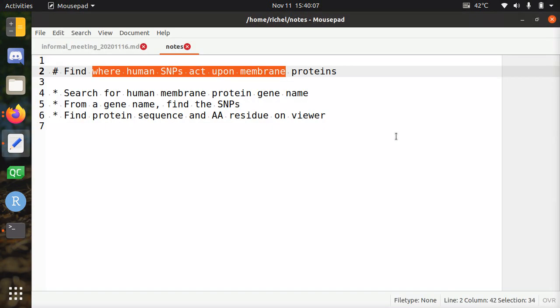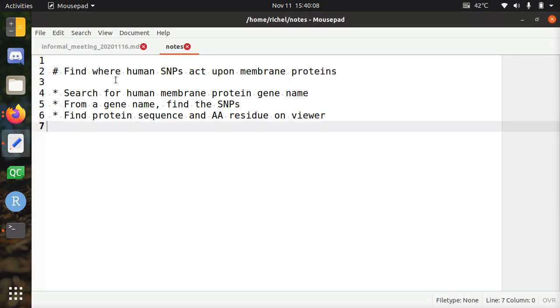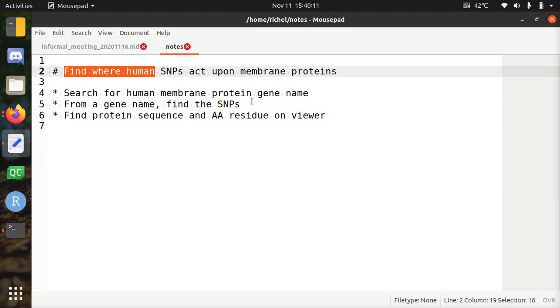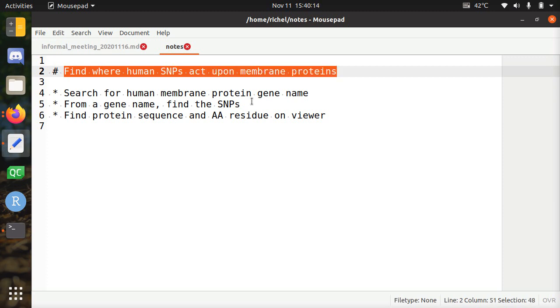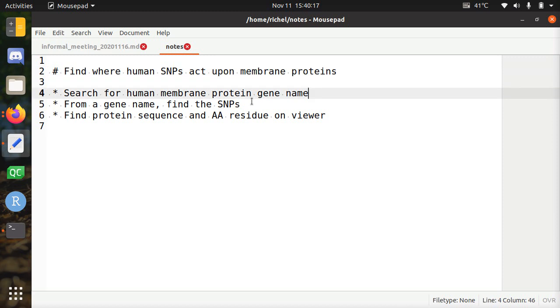Hi. The goal of this video is to demonstrate how to find where human SNPs act upon membrane proteins. And these are three steps.